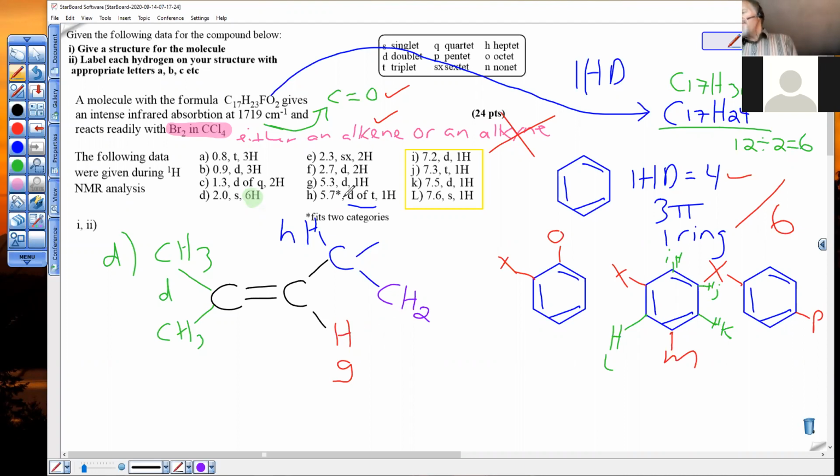Why do we see such things where there's a pattern of patterns? When the neighbors are very different chemically is when you see that. This is a vinyl H attached to an alkene. It's vinyl. This is not vinyl, which makes it a different category. They have different influences on H. They're treated almost individually. And it's the better machines that can give you these. Cheaper machines would just give a messy looking peak. You might not even be able to make out patterns. All right.